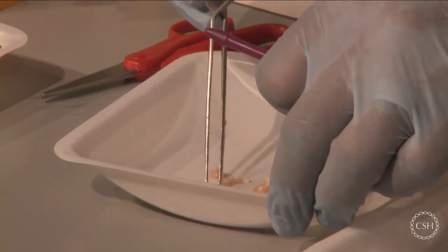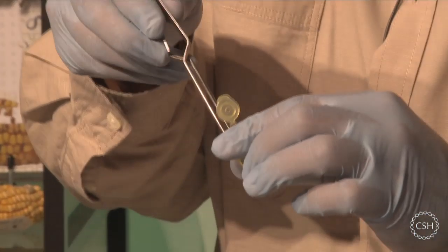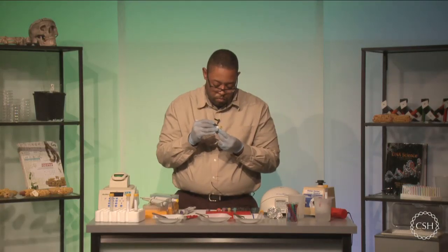So what I'm going to do now is I'm going to take that piece, and I'm going to add this to my next test tube. And then I'm going to label this sample number 2. And this is my pork.